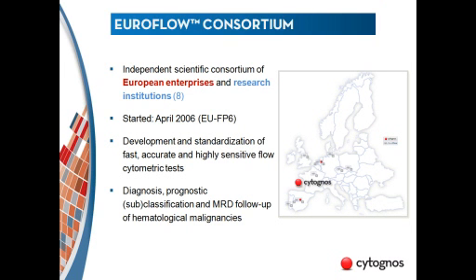Cytognos has the role within EuroFlow of developing some software tools for the analysis of the data generated by the EuroFlow approach, as we will see later, and also Cytognos has the rights to develop some of the antibodies that will take part in the EuroFlow panels, as well as the screening tubes, the screening combinations that we are going to see widely today.